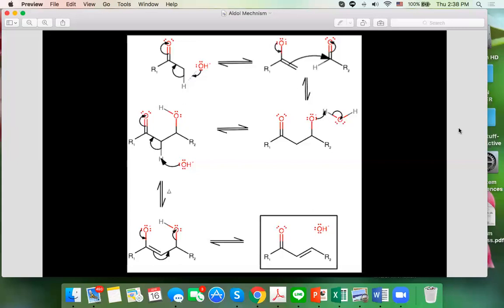All right, so my goodness. Let's get the accounting sheet clean and balanced and straightforward. What do you call the hydroxide? Is hydroxide a reactant? The answer is no, it is just a catalyst because it gets regenerated here. Now, besides the end product that has this conjugated system, I also produce a molecule of water, right? So when you put two reactants together, both having a carbonyl group, the minute they create a CC double bond, one of the oxygens is gone. Where does it go? Into water, am I right? Because water is a byproduct.